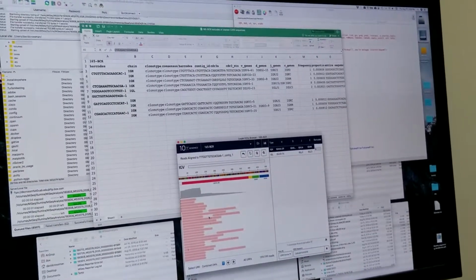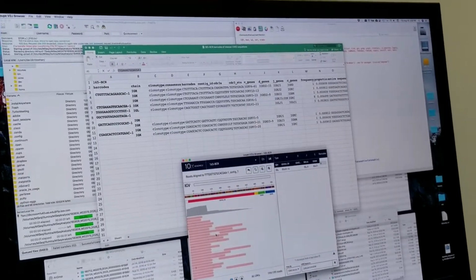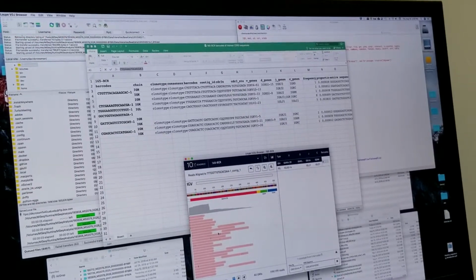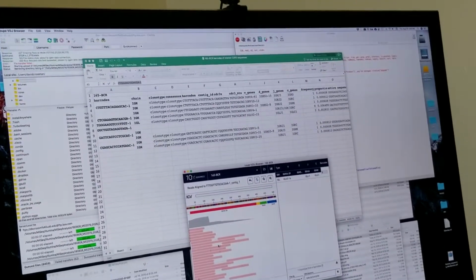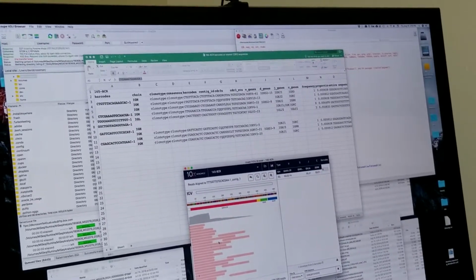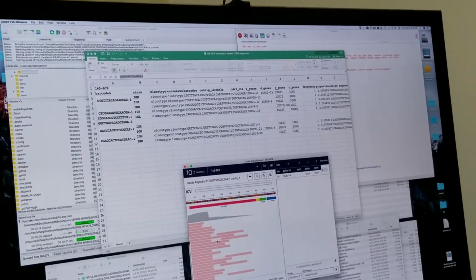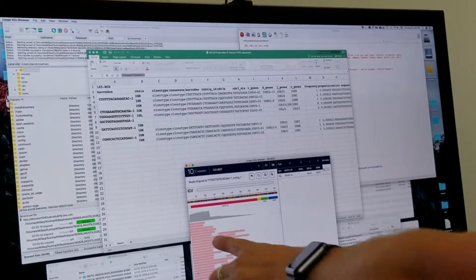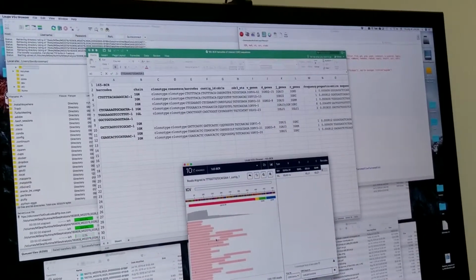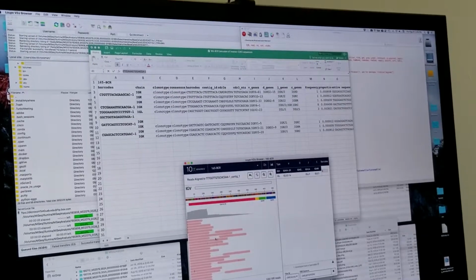Yes, you can. But I think we were following what 10X suggested. They said to do paired-end 150. Maybe we need to go back to their protocol and their kit and see. Well, is it a 5' bias? It looks like it is. To my knowledge, I didn't think it was supposed to be. I thought it was supposed to sequence the entire VDJ, and I would expect to see a nice coverage histogram across all of it. But you can see it tails off. In fact, I don't see any gray going to the right, to the CDR3 region.